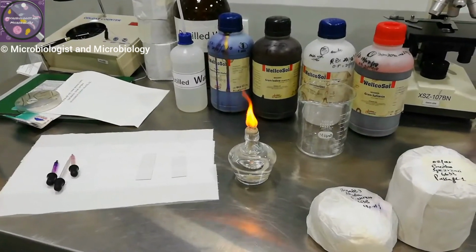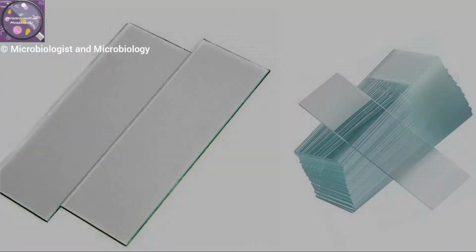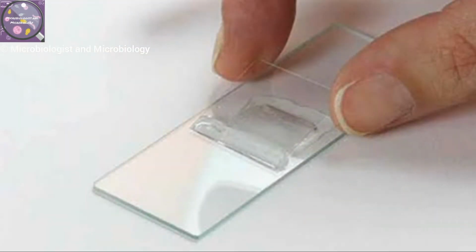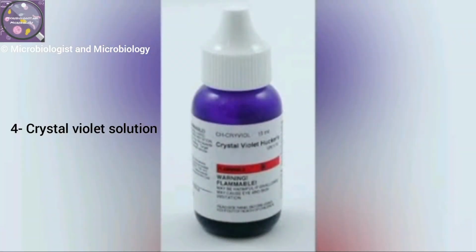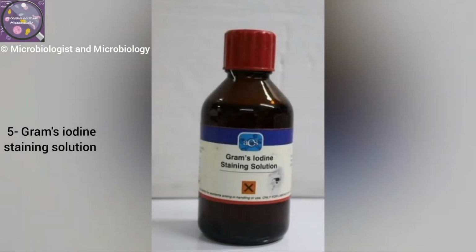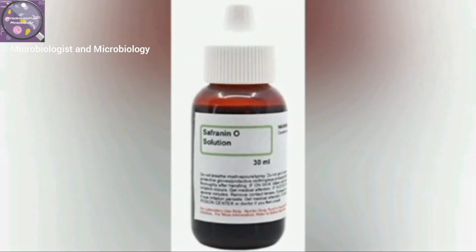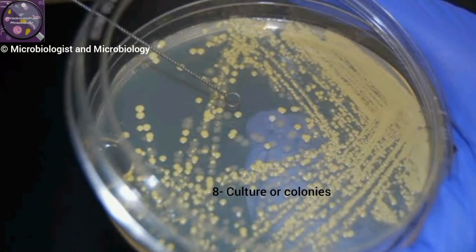First, check out the requirements. For gram staining, you may need transparent glass slides and a cover slip. It not only gives the viewer better control over the specimen but protects the microscope as well. The cover slip protects the ocular lens from damage by acting as a barrier. You will also need acetone or 95% ethyl alcohol, crystal violet solution, Gram's iodine staining solution, Safranin solution, cedarwood oil, and some kind of pure culture or sample of found colonies.